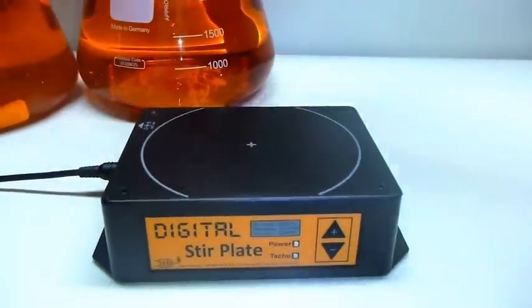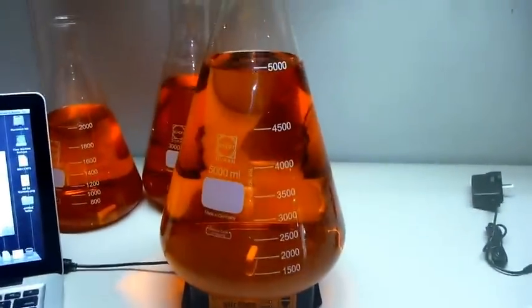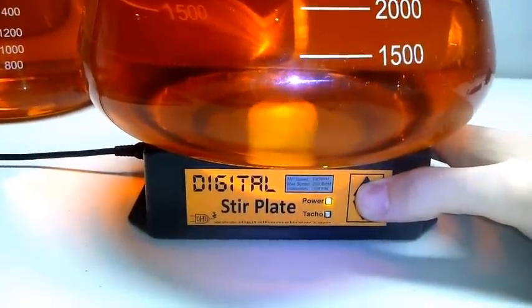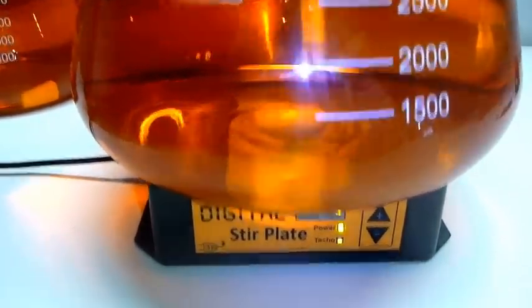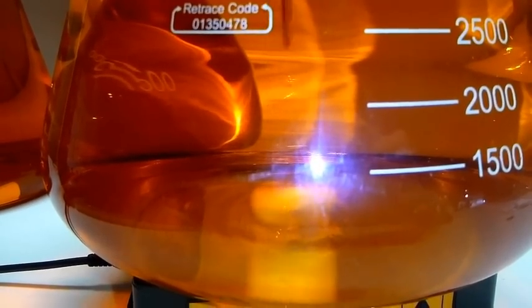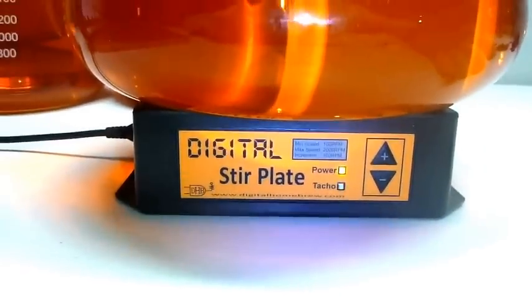And finally we'll test the 5-litre flask. You can see here the 5-litre flask absolutely dwarfs our stir plate, but thankfully the yeast won't know what size stir plate you're using — so long as they're being moved around and kept in motion it probably won't matter. It takes a while for the 5-litre to spin up and get a vortex going, but what you're seeing here is there's no trouble with the stir bar coming off — we're running at full speed. Your mileage may vary depending on the quality of your glassware and how thick it is, but here we go — we're getting a small vortex coming down and that'll eventually reach its tip down to the bottom and start sucking in air.